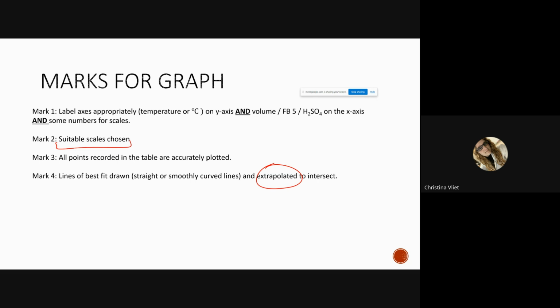There's always a small error. You've got to know this. So some of the key points in this experiment, because think about it, time is passing. As time is passing, heat is continually leaving.